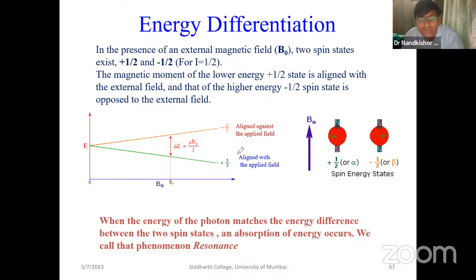The nuclei which spin on their own axis produce a magnetic field. When placed in a strong magnet, as per the Zeeman effect, they show the plus half and minus half energy level splitting, that is what we call a loss of degeneracy.